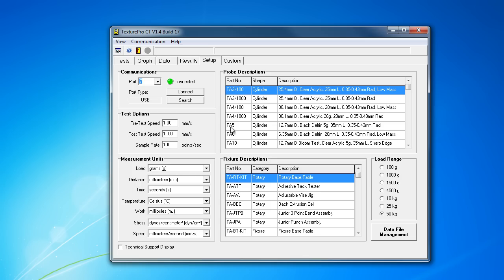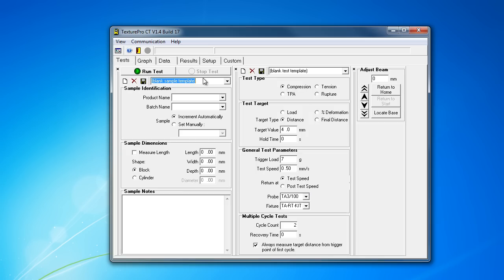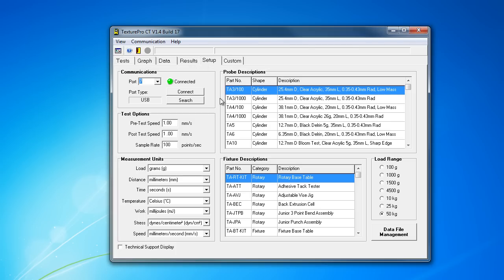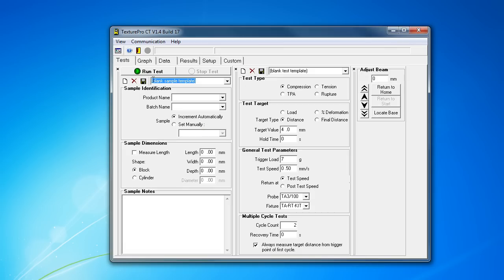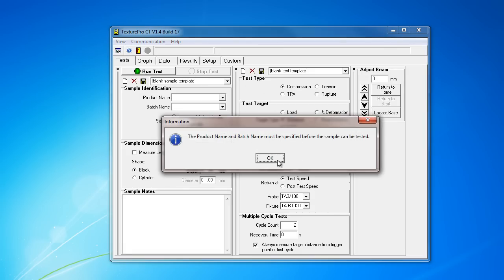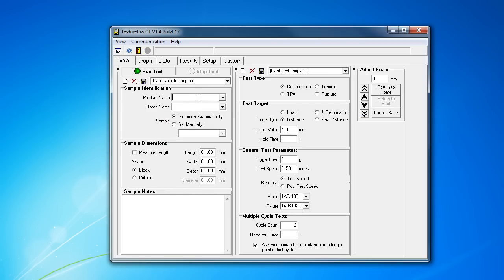In the setup, of course they split these options. Half of them is in your test and half is in your setup. I'm just going to switch my pre and post test speed. I'm going to do 1.2 speed up a little bit. It tends to take forever going down. I'm just going to run this test.